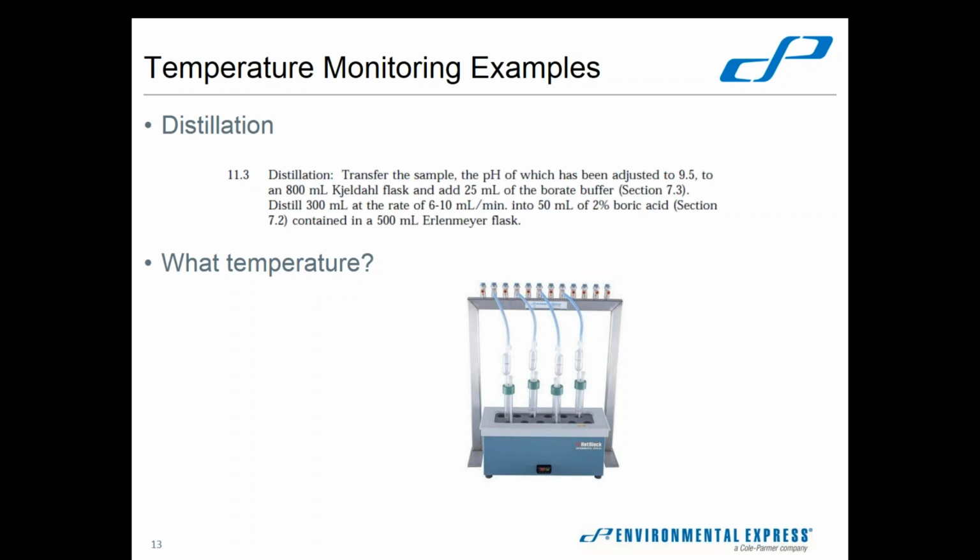Is there an actual difference? Do samples in their distillation system only distill at 160 degrees? Does the sample temperature need to be 160 for them and only 130 for us? No, that's not how it works. That's all about getting the sample temperature high enough to make distillation happen. What is distillation?